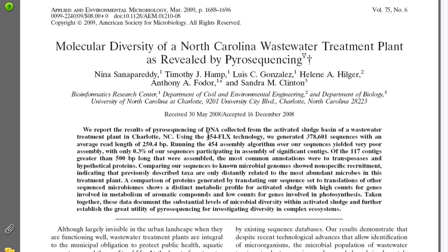So as you can see here, the result of this experiment was reads from the 454FLX platform and generated 378,000 reads out of those examples.